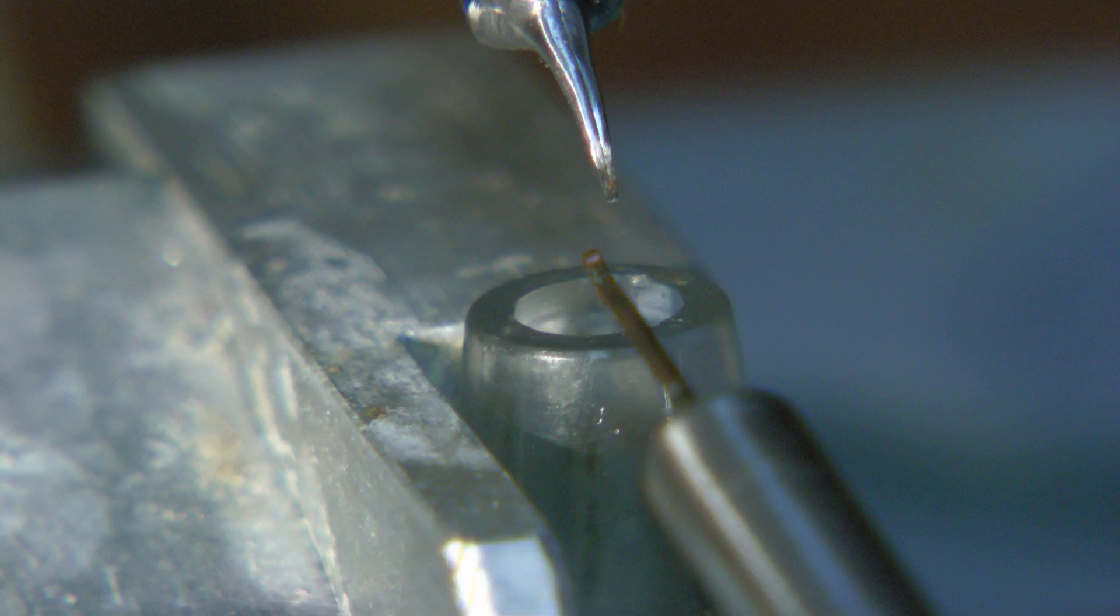Bill will place the virgin queen in the tube so her abdomen sticks out. He will flow carbon dioxide up the tube to put her out.